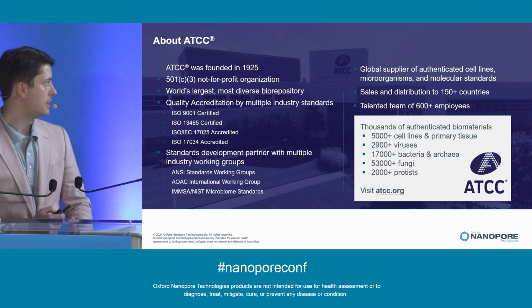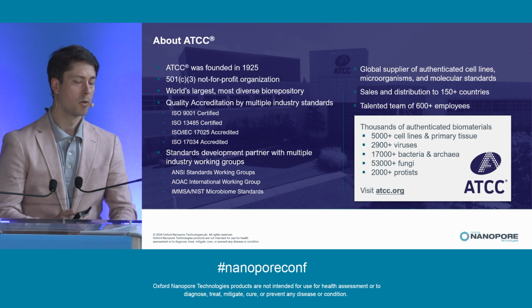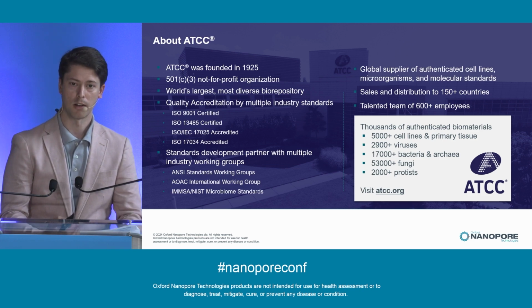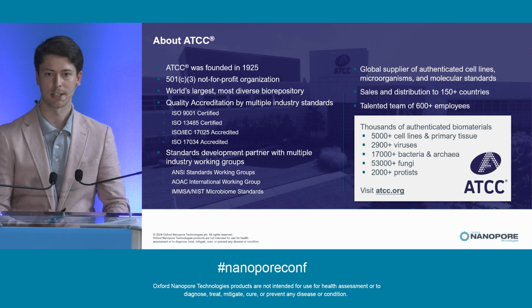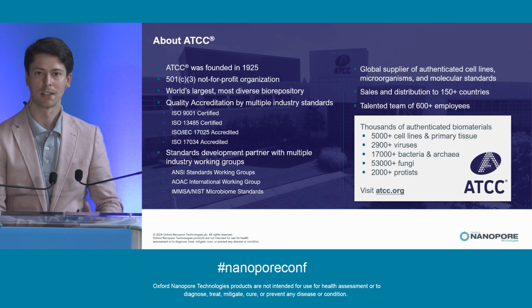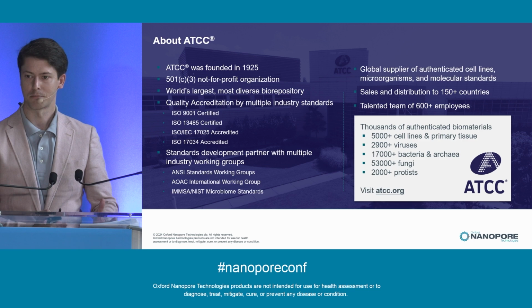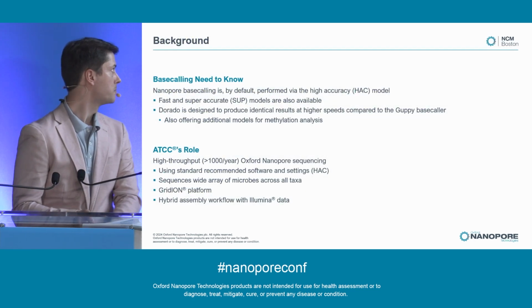But part of that is reproducibility, because ATCC is also a standards organization. So when Oxford Nanopore launched the Dorado software, we couldn't simply adopt it, right? Taking changes into our production processes is a complicated and heavily justified procedure. So we set out to evaluate that in more detail.